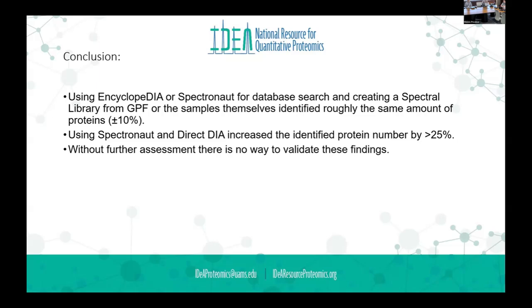It's a problem, because I also don't know, they have different options and the default is set to the mean for the roll up for both of those, which if you got an outlier is not good.